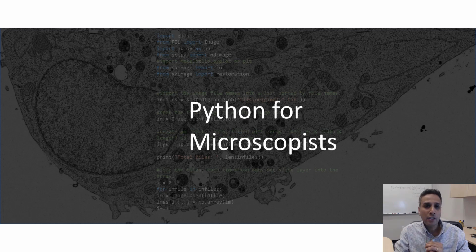Now, there are many ways of reading images into Python because there are different libraries that can actually handle 2D and 3D and multidimensional data. So I'm going to talk about 3 or 4 of these libraries and show you how to open images, and I'll also comment on the primary purpose of a certain library, so you can decide which library to explore further for certain tools for image processing.